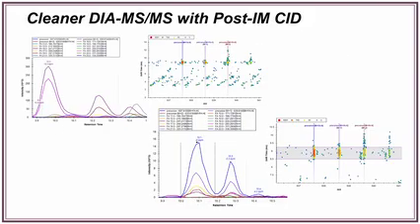And so here is another example of how that can improve things like your chromatography. If you've got a lot of stuff that's co-eluting, overlapping peaks that may be very different intensities, you can use this sort of ion mobility filtering, even in the MS1 dimension, to remove the noise away from what you're really interested in. And so you can see how dramatically it changes these extracted ion chromatograms by applying an ion mobility filtering step.